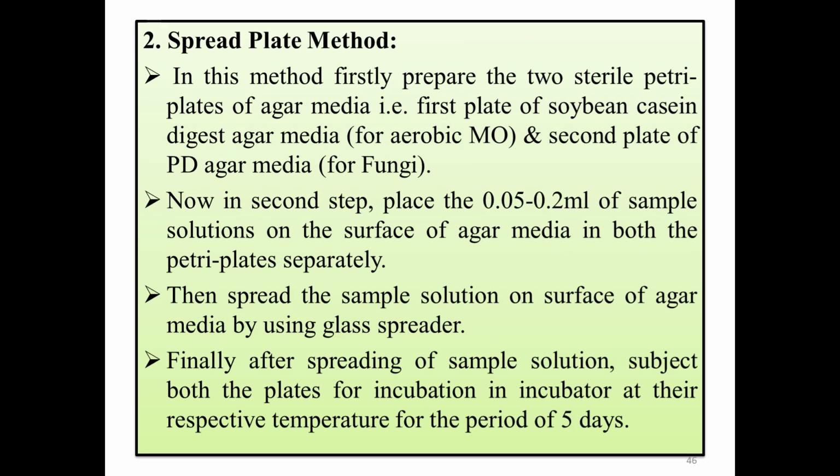The second method is the spread plate method. In that we didn't use the membrane filter. We have directly applied the sample solution on agar media, and we have cultivated it for a specific period, that is 5 days. Then we'll determine the number of microorganisms present on both nutrient media, that is PD agar media, and the second one is soybean casein media.